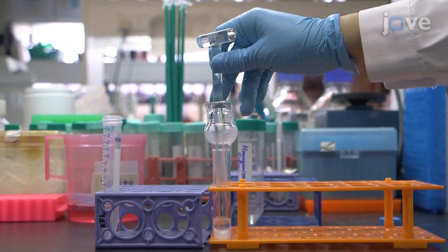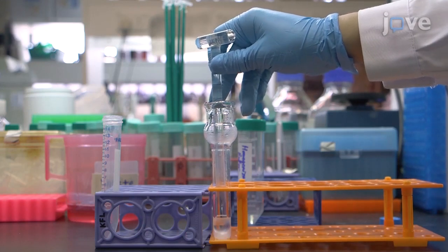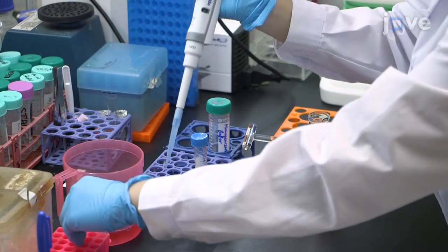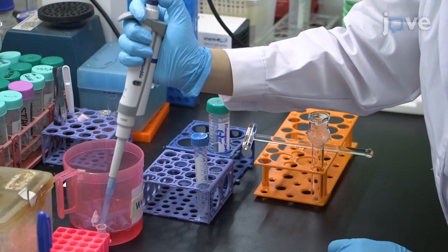Homogenize the cells with a Downs homogenizer using 15-20 strokes, then transfer the homogenate to a 2 mL centrifugation tube.